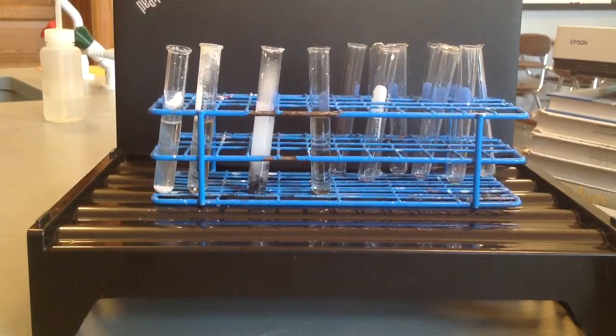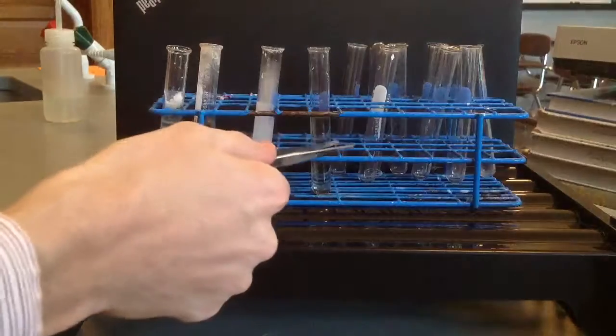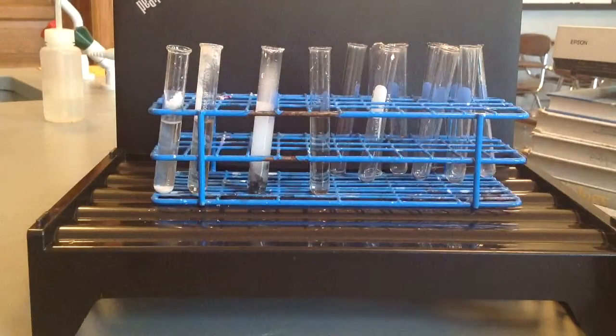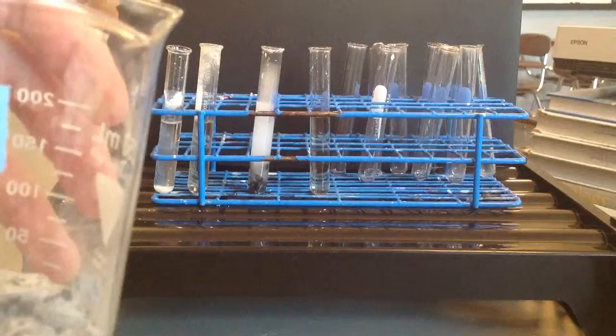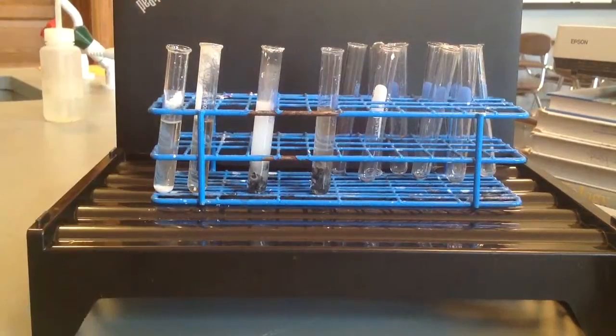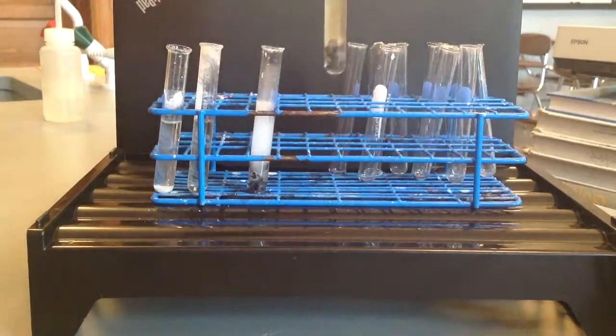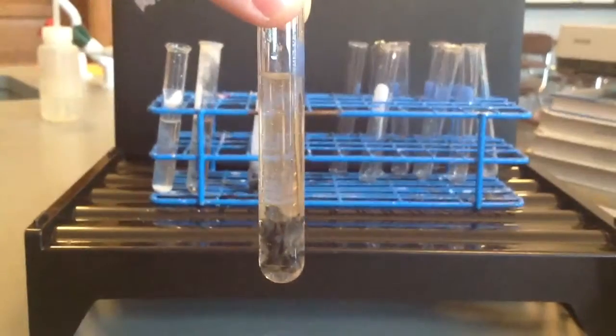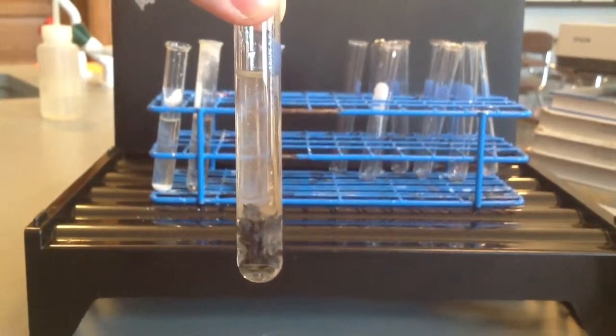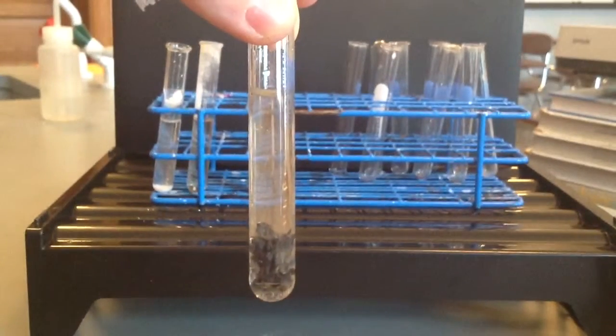Okay, now for the next part, we're going to take acetic acid, which I've already put into this test tube right here, and we're going to add some zinc to it, and then basically do the exact same experiment. Alright, so I'm going to add some chunks, and then after I've added the chunks, I'll show you what's happening inside the test tube. Okay, so here we go with the acetic acid and the zinc. Now that you see what's happening, I just added them, and you can see the reaction taking place, and make some observations.